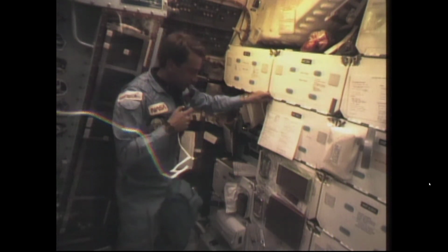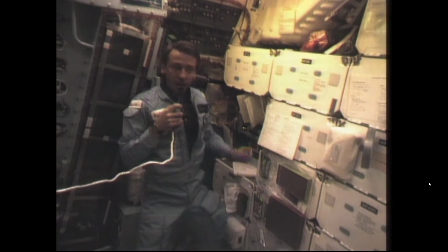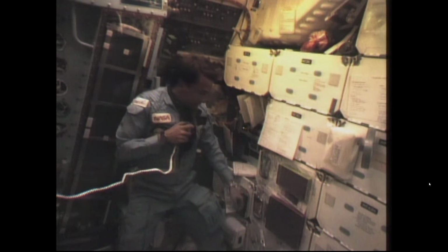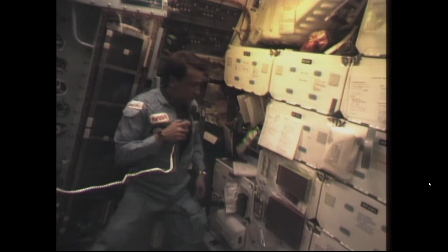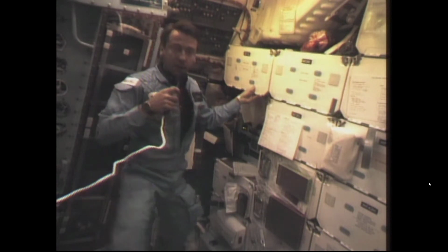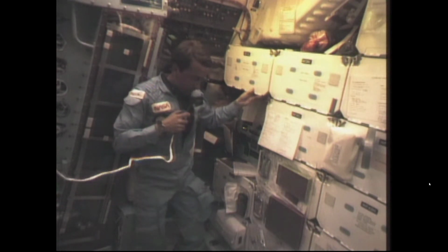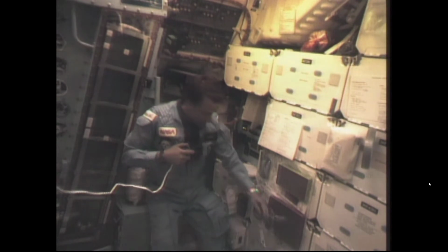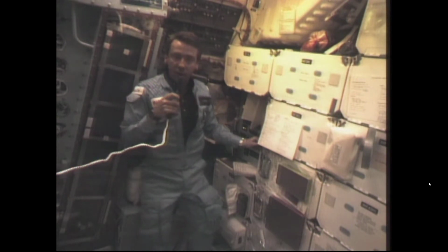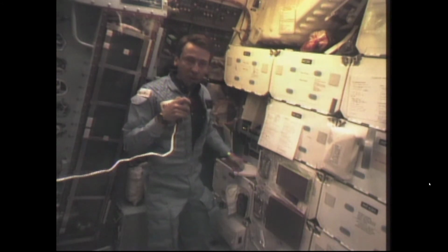And I even have a chemistry set which tells me when the hormone is present and when I'm successfully collecting it. Right now I have an assay ongoing, transferring fluids from various containers like this one that you see to other containers, back and forth, mixing, flushing occasionally, ending up with a test which will show the presence of that hormone. Various components here are not that complex, but it takes a lot of work and concentration to make sure that you're getting things correctly from one test area to another, or one component to another.